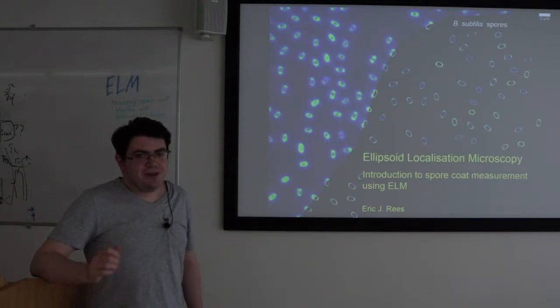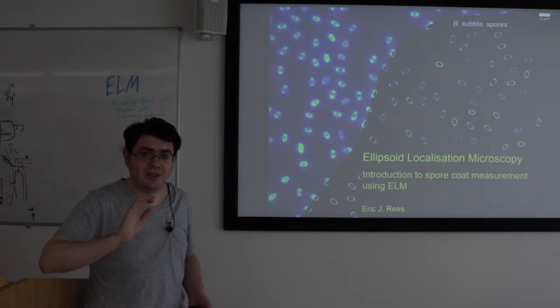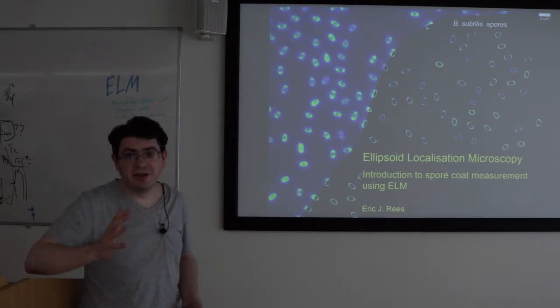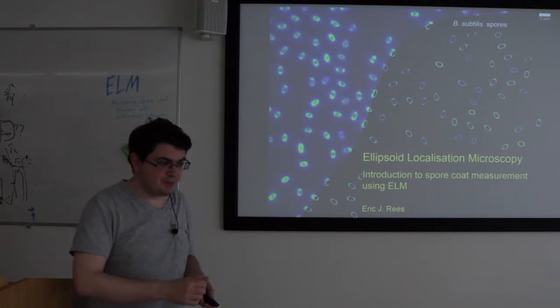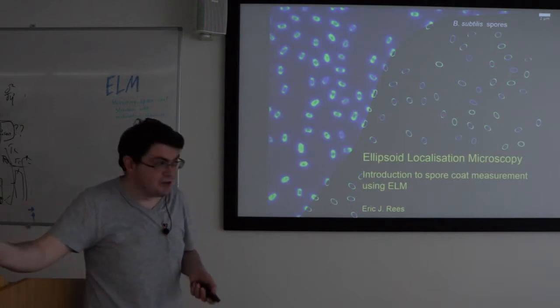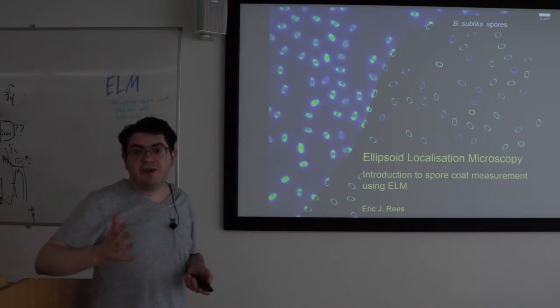Hello everyone. Some people have asked, can we have a video introduction to the ellipsoid localization microscopy method for measuring bacteria spore coat structures? Yes, the answer is yes, you definitely can.